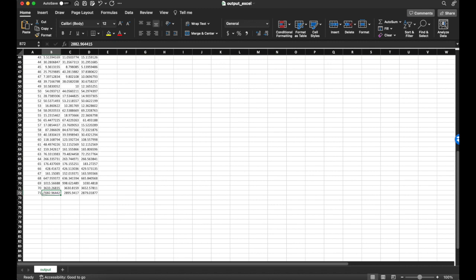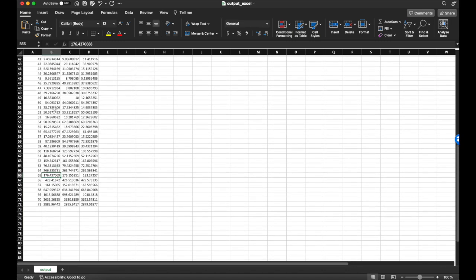And they all have the same number of rows because in this case, these three images, we chose to analyze them through the radial grid method. And in the radial grid, typically there are 71 rows. But if you analyze your shape through the parallel grid, then each column or each sample might have a different number of rows, depending on how tall the object or the shape is. So just something to know about how many rows to expect in the radial grid system versus the parallel grid system.